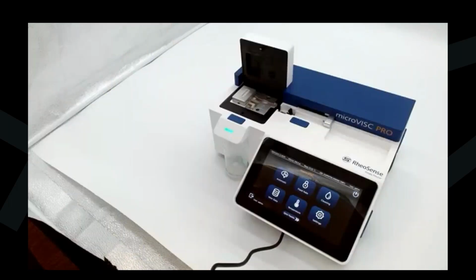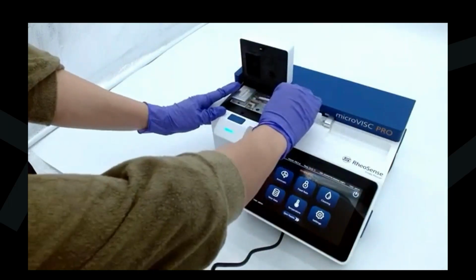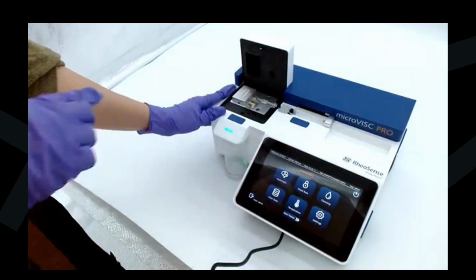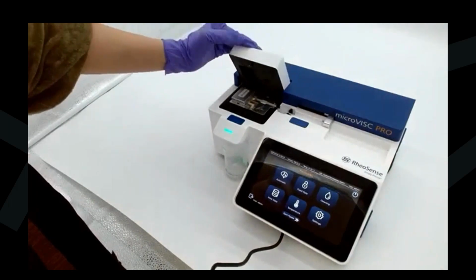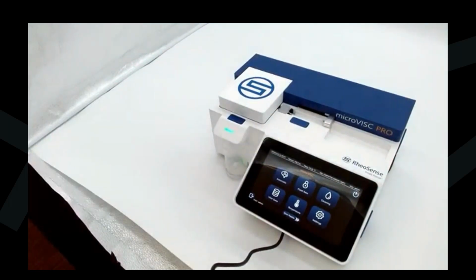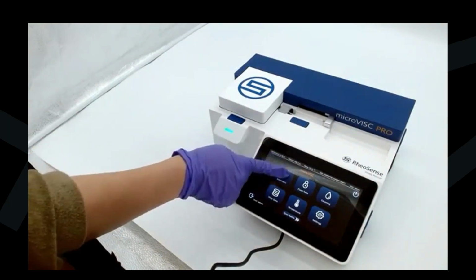Now that we loaded the sample, we're going to measure the viscosity. We're going to introduce the pipette into the instrument. We can see that we're connecting it to the chip. This is a C10 chip, which is great for these high viscosity emulsion samples. Now we're going to close the chip cover here, and we're going to be using an automatic measurement mode for these measurements. So we tap on that.